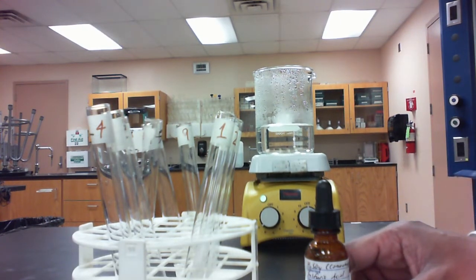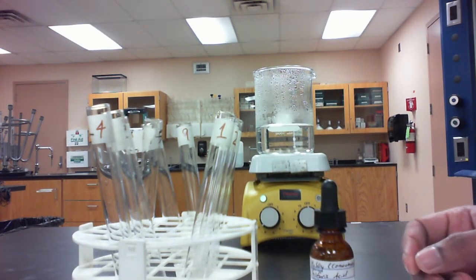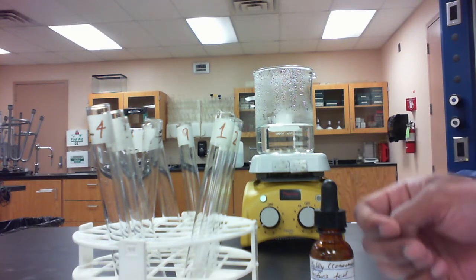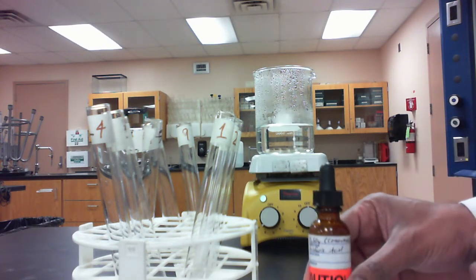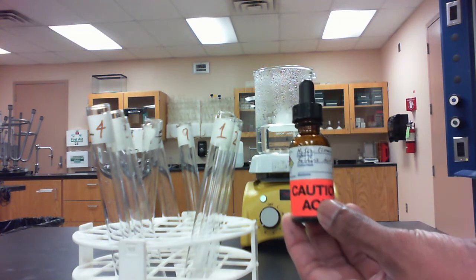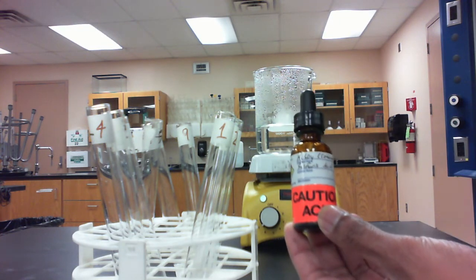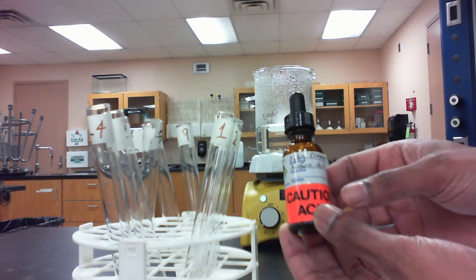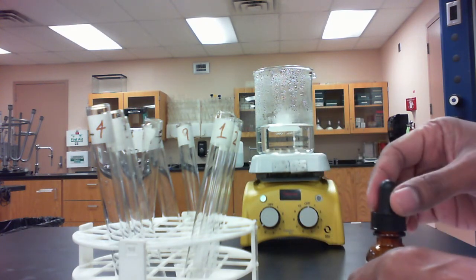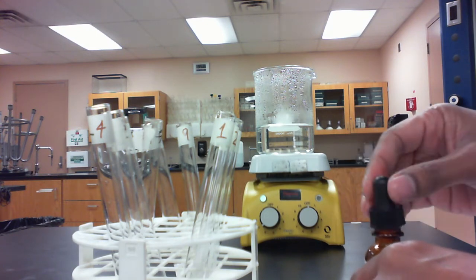So the third and last thing that you want to make sure that you add to each of the tubes, in addition to the acid and the alcohol, is that acid catalyst in order to speed up the reaction. The catalyst that we're using today is concentrated sulfuric acid. We're going to add 4 drops of the concentrated sulfuric acid to each of those tubes.